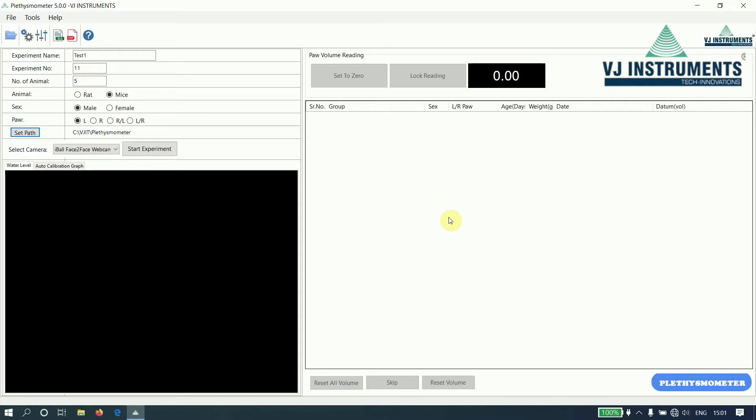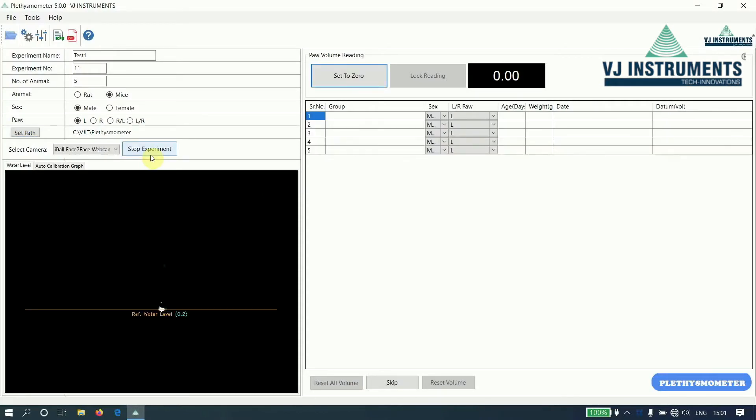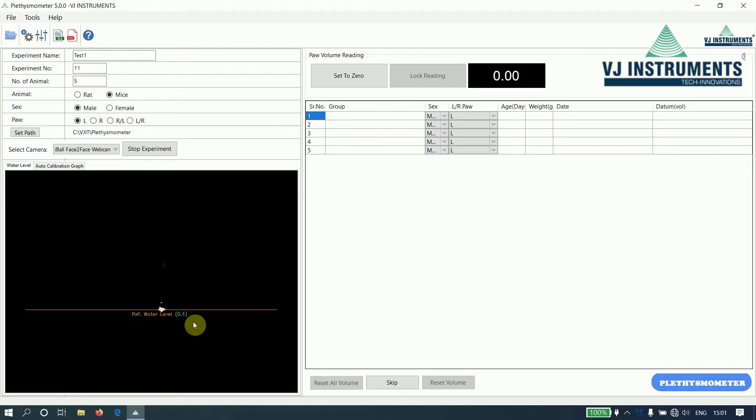Now let us start the experiment by clicking the start button. Once we click on start button, the reference water level is displayed here. It should be within plus or minus 5.